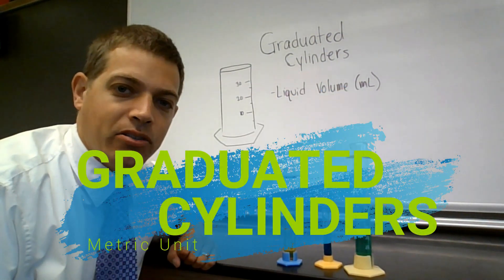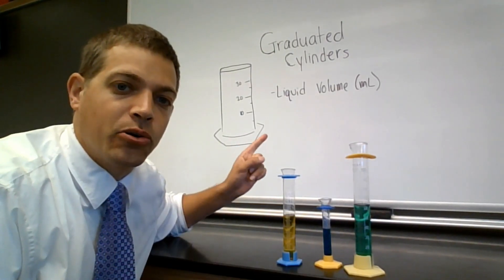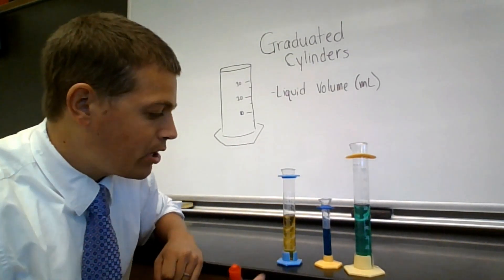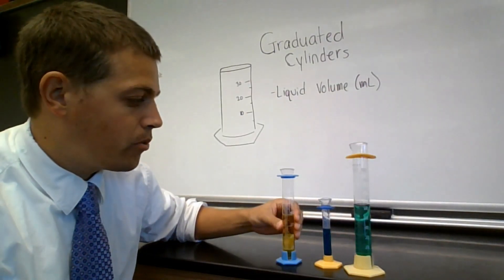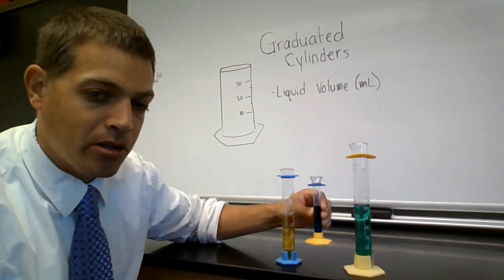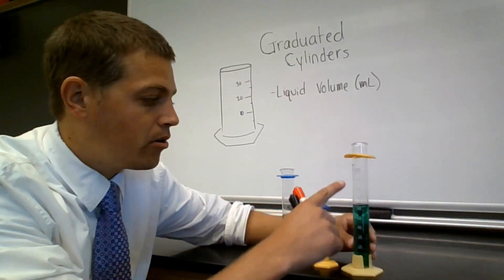Welcome to our video on graduated cylinders. A graduated cylinder is a tool used to measure liquid volume. We have three right here: one that measures 50 milliliters, one that measures up to 10 milliliters, and one that measures up to 100 milliliters.